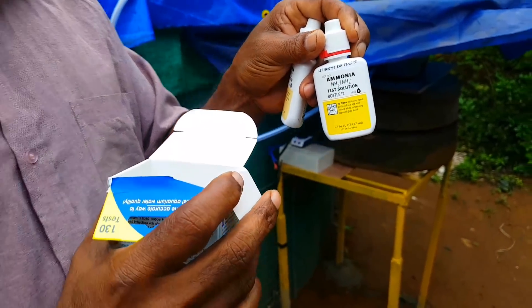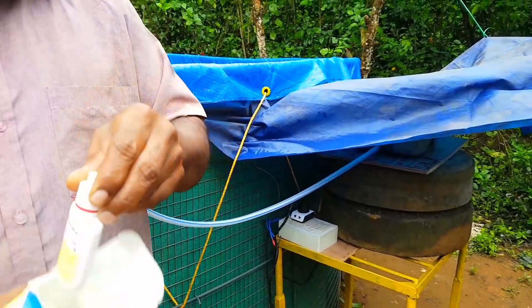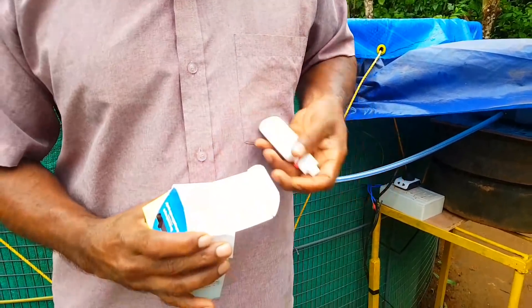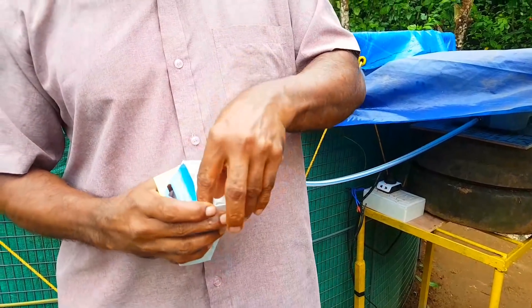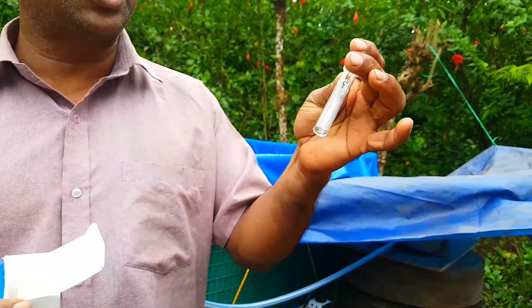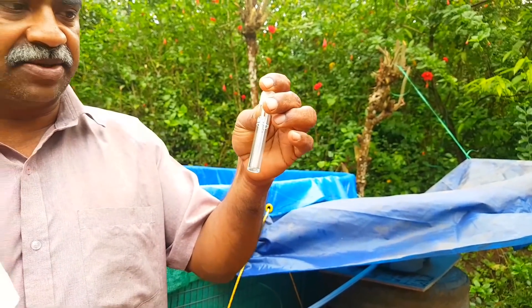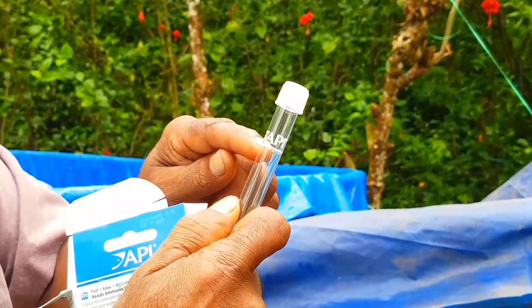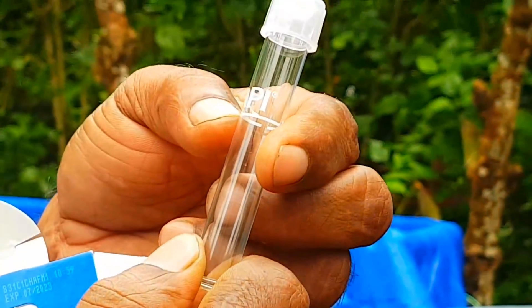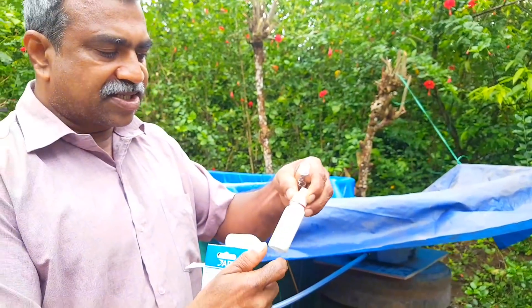This is the test solution bottle number 2. This is the test tube. The test tube has a mark. It has 5 ml.